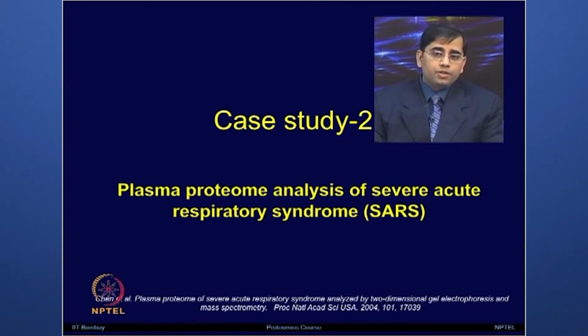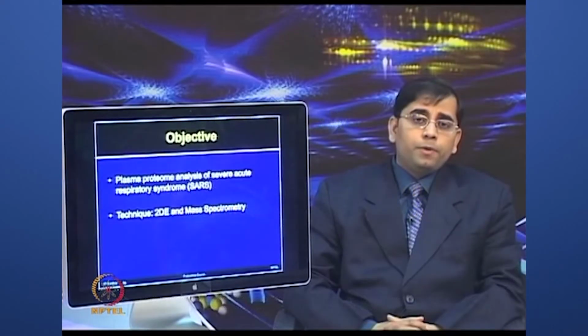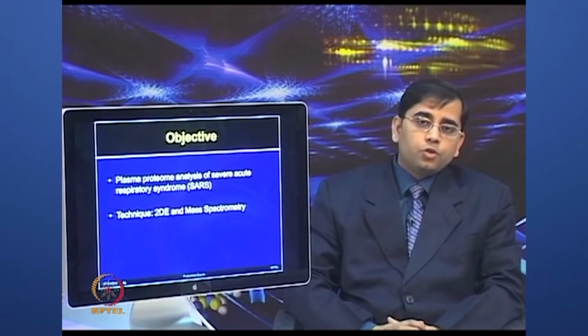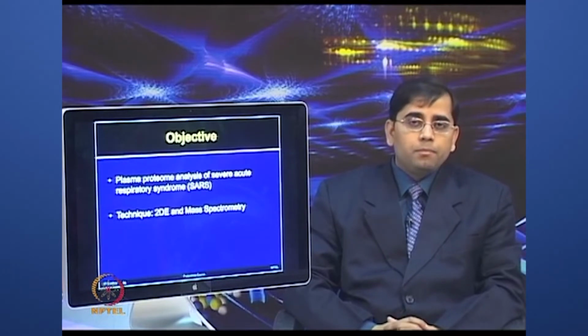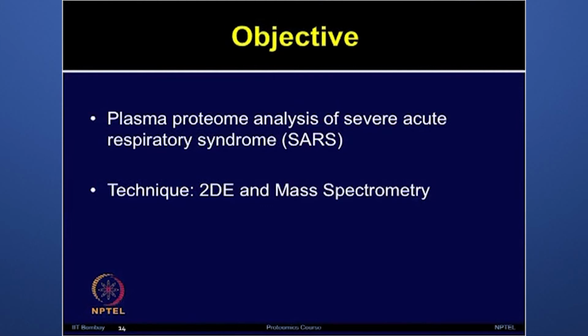In 2004. So, the purpose of the study was to perform a comprehensive plasma proteome analysis of severe acute respiratory syndrome and its comparison with healthy individuals.